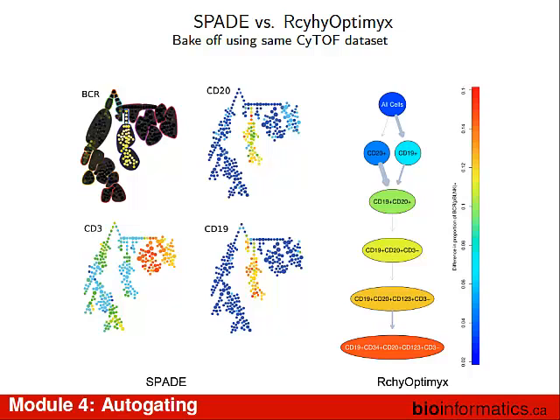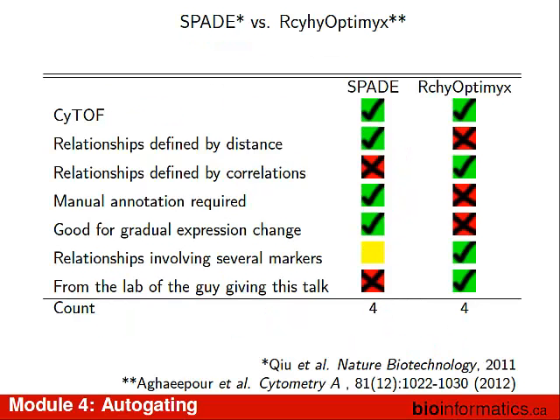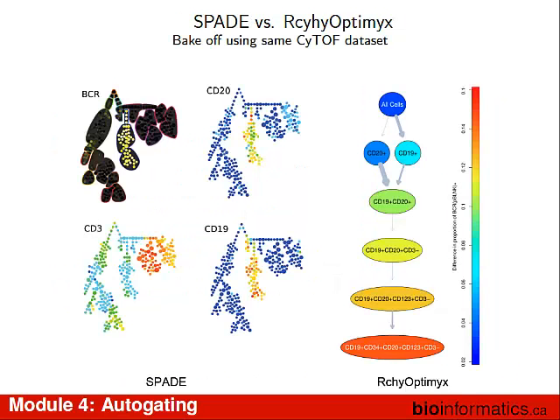No, I'm just looking for a definition. The measure here is how far apart these populations are, which allows them to group these things together. And here, this p-value is based on the ability of the population to distinguish between the labels that you've assigned to the samples. So you put these in group one, these in group two. This population has a very strong ability to predict which group you belong to.